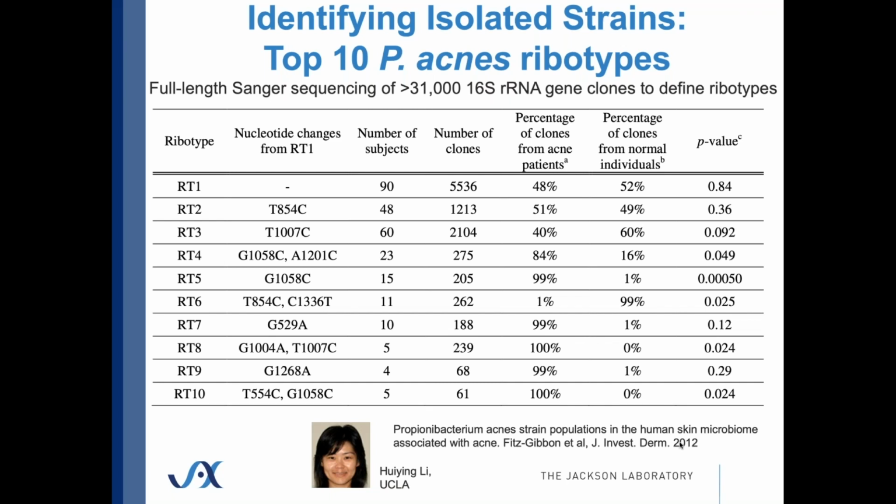that we found. So in the second column of the chart, you can see here's the difference between the 16S sequences we're seeing. It's usually only 1 or 2 nucleotides different because these are all the same species. And this is the frequency of polymorphisms that you see with P. acnes. And you can also see the number in that second column is the position in the 16S gene. And so you can see they're all over the place in the 16S gene. There's not a particular hotspot, a particular variable region.